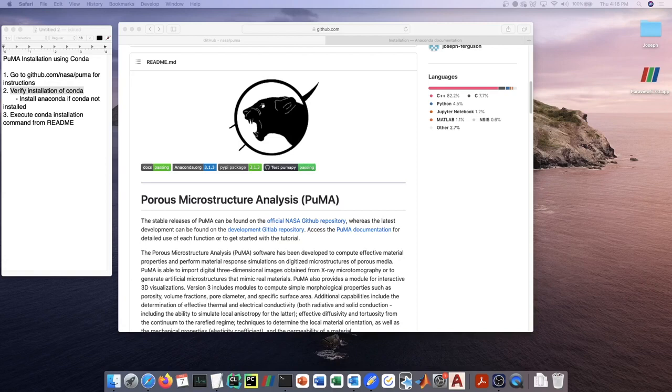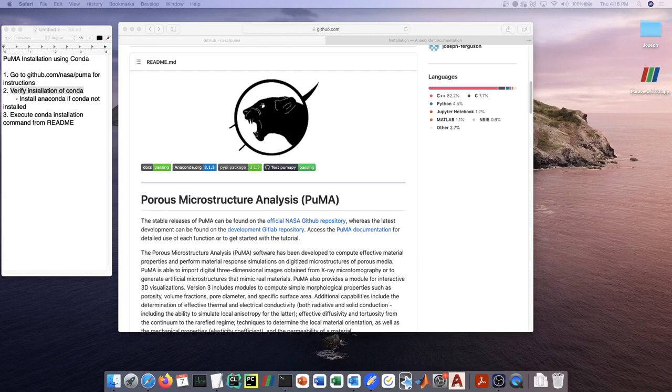We've really done our best, the development team of PUMA, to make the installation as easy as possible. We're painfully aware of how hard it is to install most scientific software, and so we've really tried to avoid that.